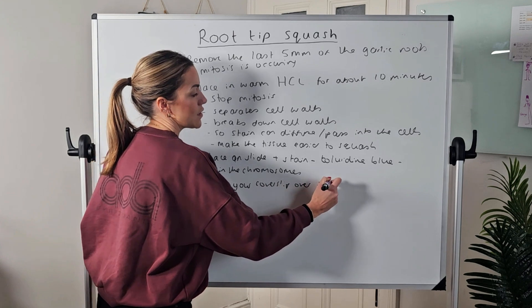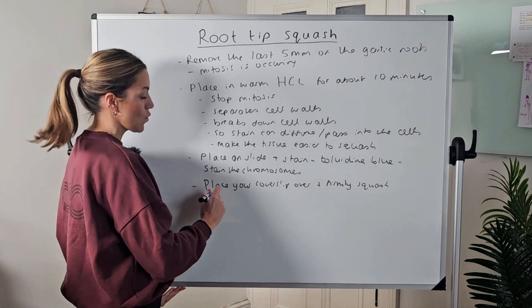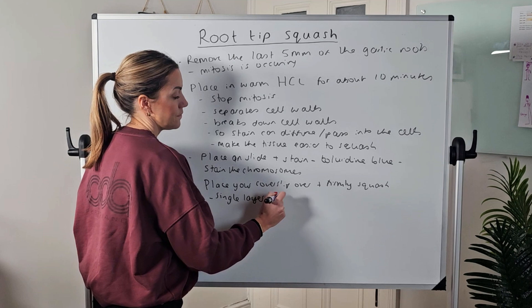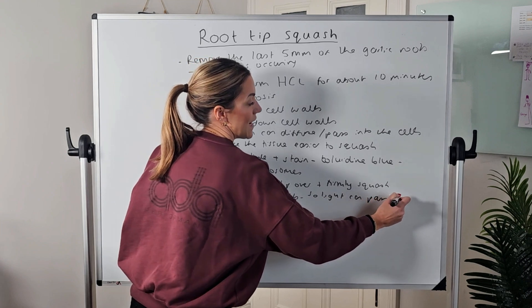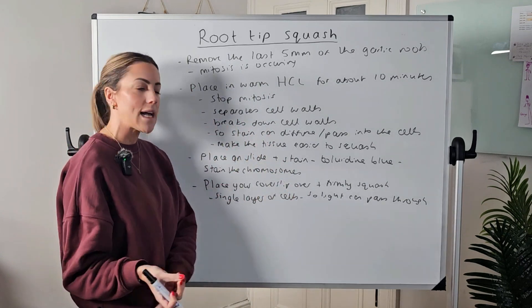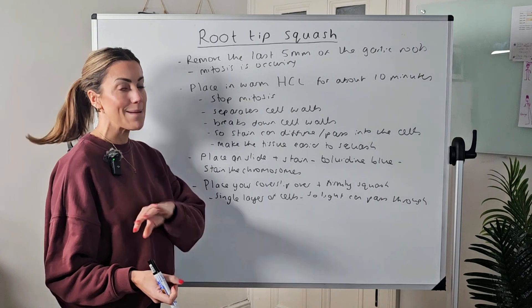Place your cover slip over the sample and firmly squash it. We firmly squash to get a single, thin layer of cells so that light can pass through and the chromosomes are visible.